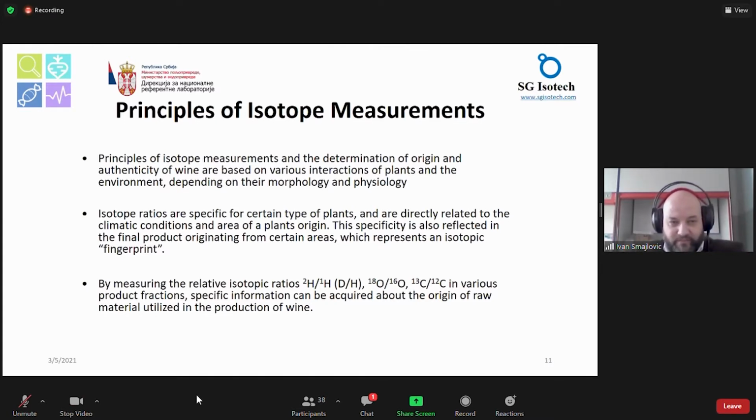One more thing. Now, I'm talking about everything and anything, and I will jump out of the presentation and come back. I said isotopic fractionation. What does it mean? So for a general chemist analyst, for example, water is H2O. For an isotopic analyst, it is not H2O. It is a variation of different isotopes which can and which are occurring in this water.